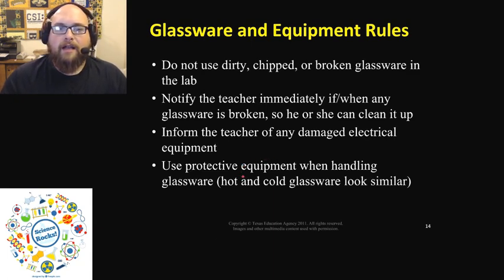Okay, hot and cold glassware do look the same regardless of its temperature. So always treat it as if it was hot.